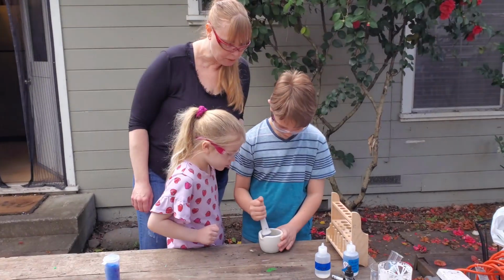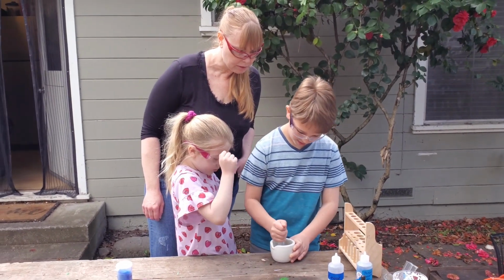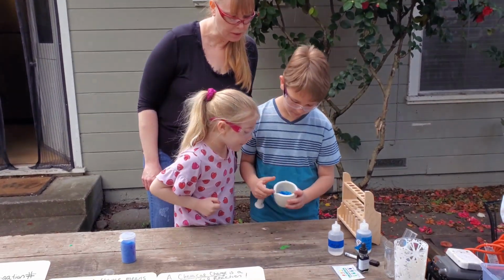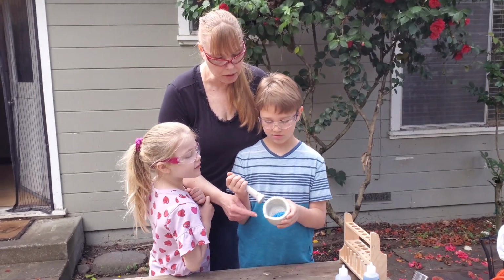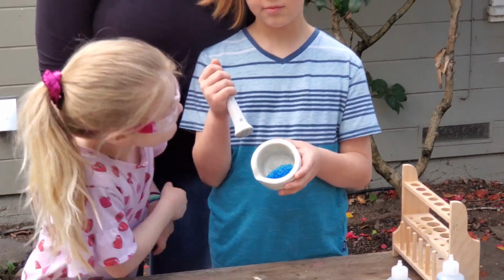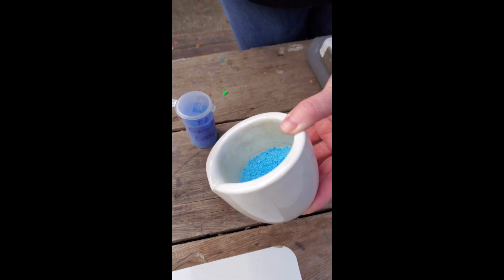Okay, go ahead and pound it some more. Okay, go ahead and show them really quick. All right, we could keep going, but here we have crushing. What does it look like now? Qualitative. Look inside there. Okay, see what the sizes are. Really quick, guys, I just wanted to show you when it's crushed up what it looks like.